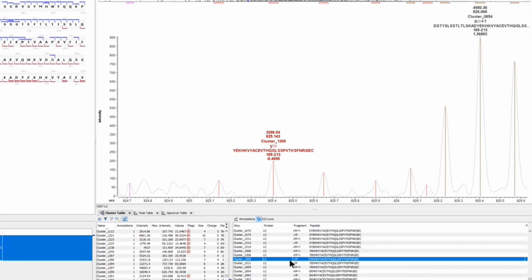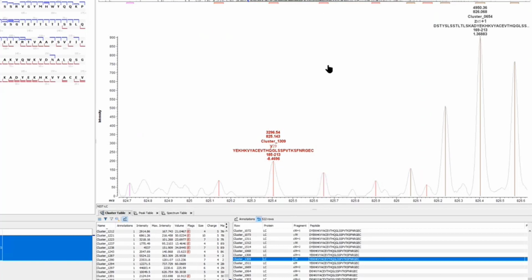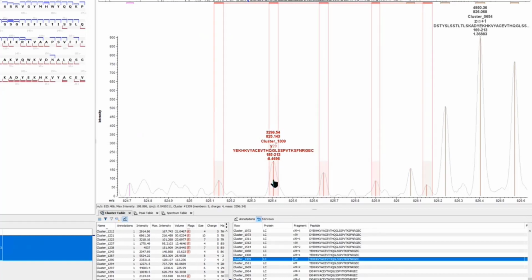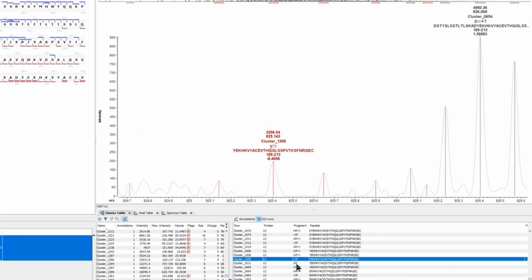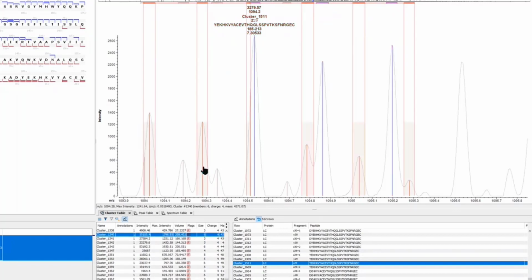Sometimes it can be a little confusing as to what you're looking at, which is why I find the labels useful, right? I've got it labeled Y29. Look for the red color. I always turn the labels on because I'm slightly colorblind. I can't always pick up all the colors. So the labels help me out. So if any of you are afflicted with the same thing that I am, make the labels work for you. Here's another complicated pattern. This cluster in amongst other clusters as well.